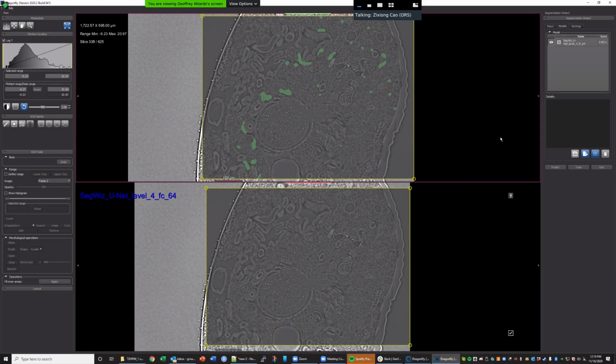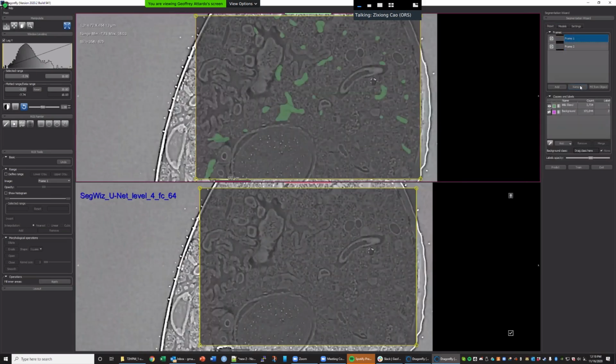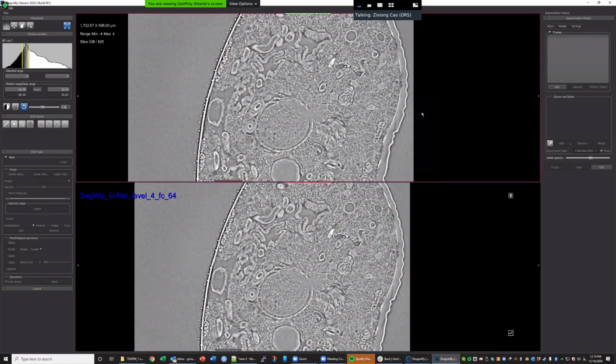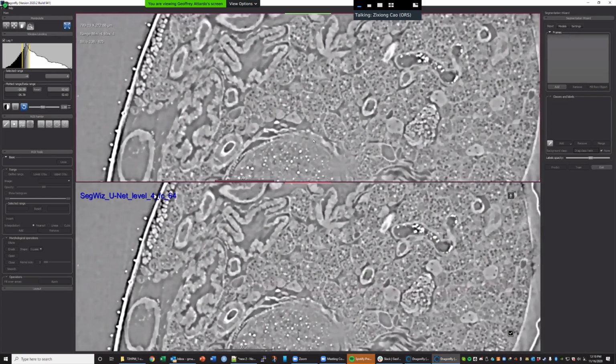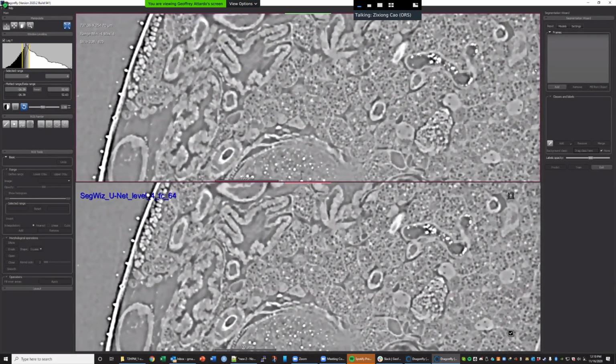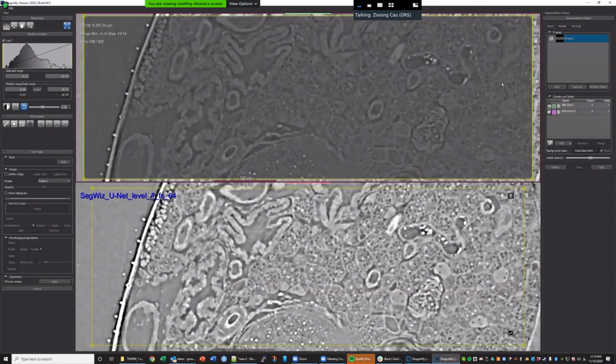Do you mind if I control the computer to do some testing? Not at all. All right, let's do a quick test to see why it doesn't give you anything. I always expect to see something first, then I see how to improve it. If I don't see anything, that's not very nice. So I try to make an even smaller frame to make it faster. And I train again, and I check if it gives anything.